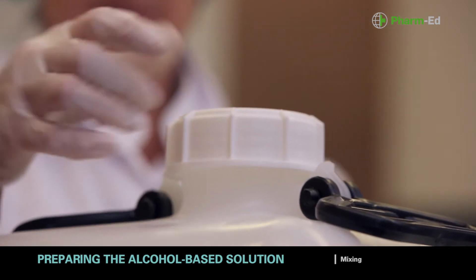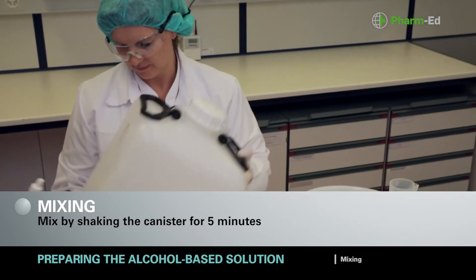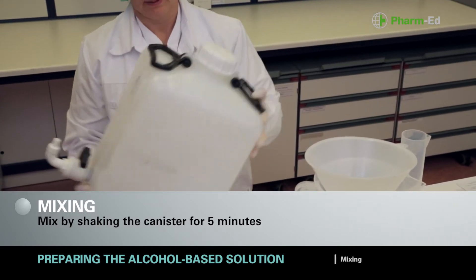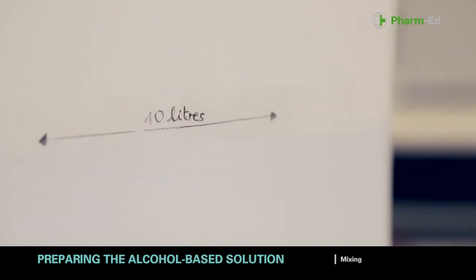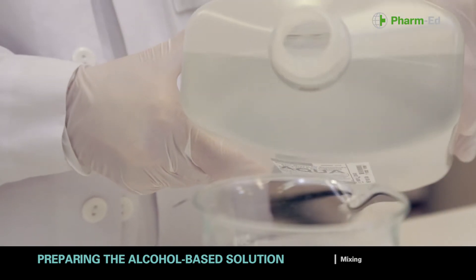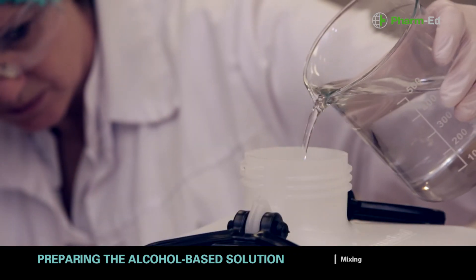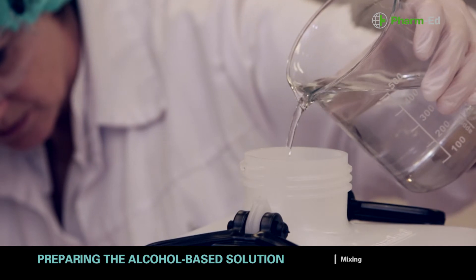Close the container by screwing the cap on as quickly as possible to prevent evaporation, then mix gently by shaking the canister for five minutes. Check the final volume and, if necessary due to volume contraction of the water/alcohol mixture, add water up to the marked level and mix again.